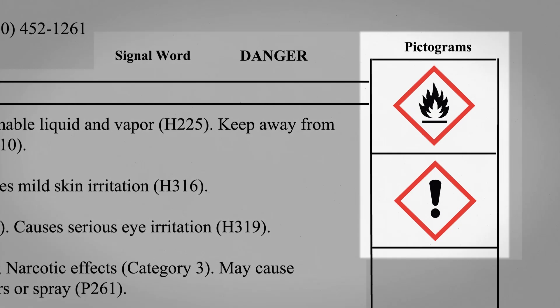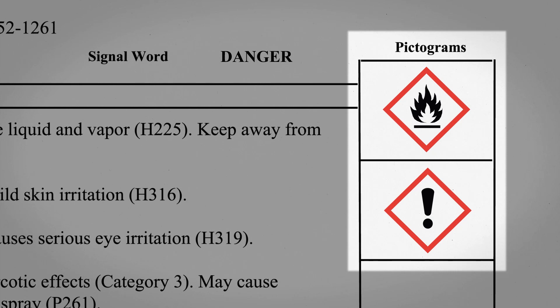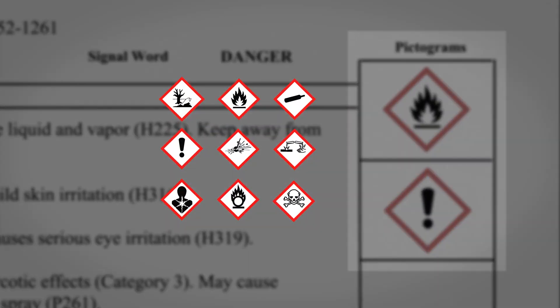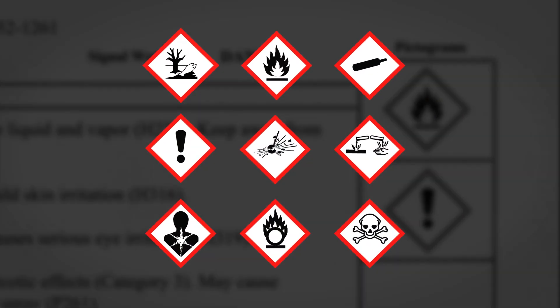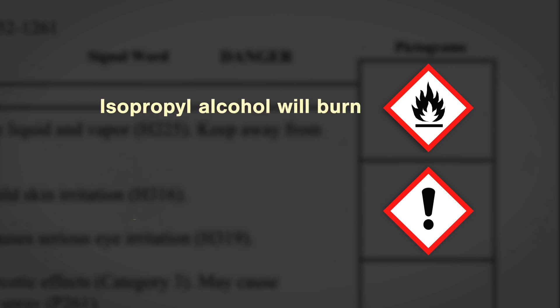The second way a hazard is identified is through a pictogram. There are nine pictograms used to describe all of the possible hazards of chemicals. Isopropyl alcohol has two: the first one, a flame, is easily understood — isopropyl alcohol will burn. The second, an exclamation point, alerts you to other potential hazards of this chemical.